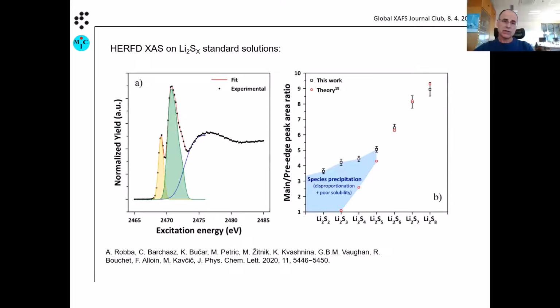And of course, we can change a bit the position of the sample, but we have never worked point-to-point focusing. Are you free to choose among point-to-point? No, we cannot move because it's a big chamber, so there are fixed entrance ports, and you can change a bit the position relative to the focal point of the circle, but you cannot exchange from one to another.